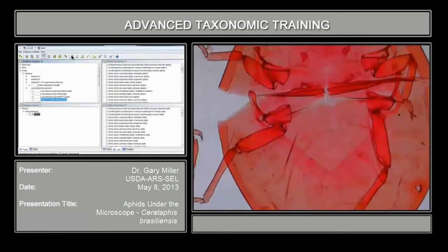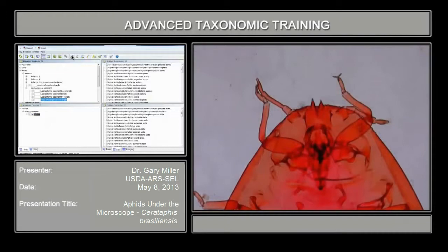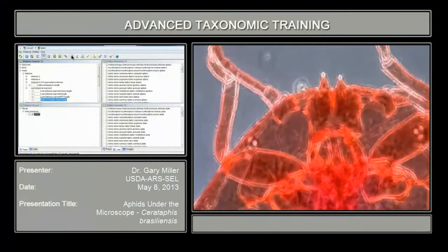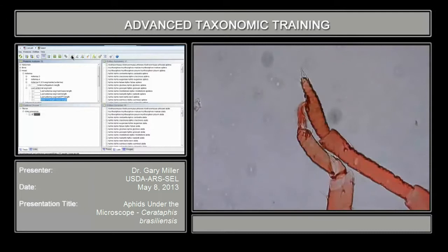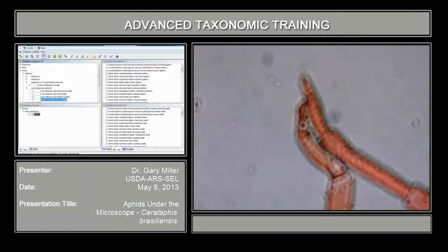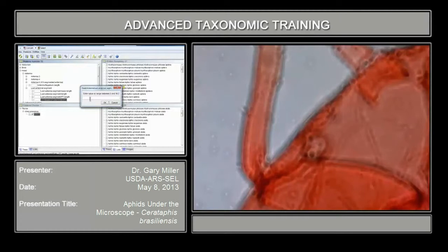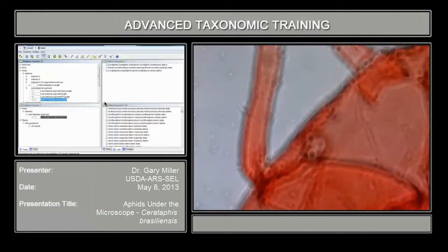Now we're going to look at the process terminalis again. You can see the antennal structure on this particular specimen is a lot different than the previous one we looked at. Routinely, aphids have usually six antennal segments, but you can see there's reduction in the adult in this one. We're going to measure the process terminalis to the base — compared to other specimens, there's a big difference. The range is 0 to 18, so put 0.5 in here. That really pruned the tree very quickly.